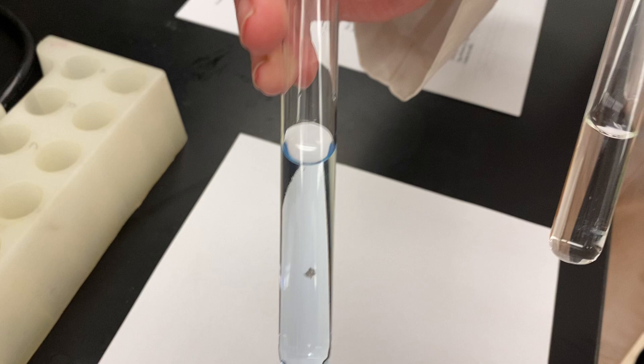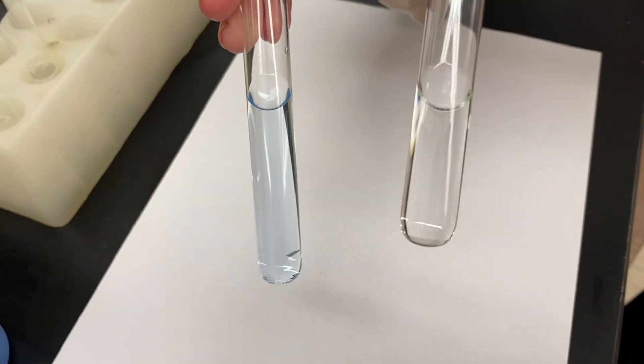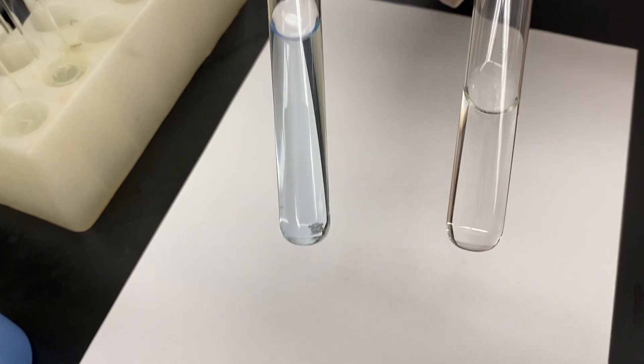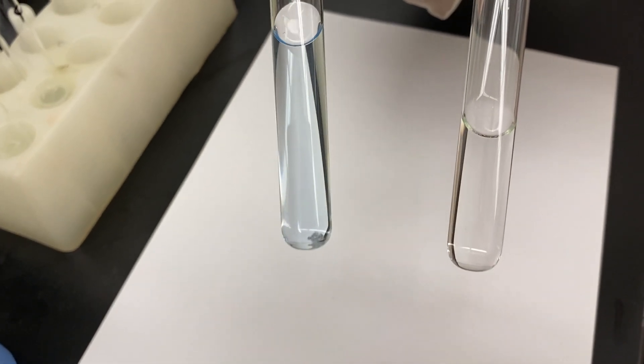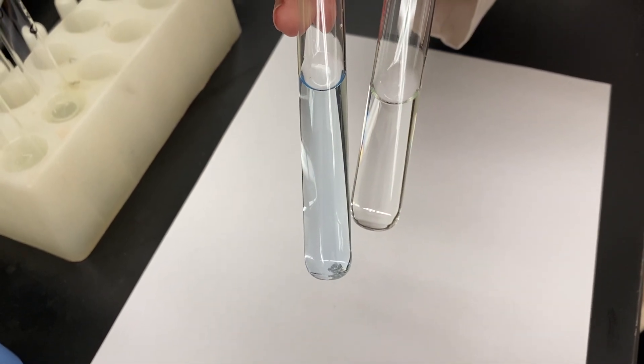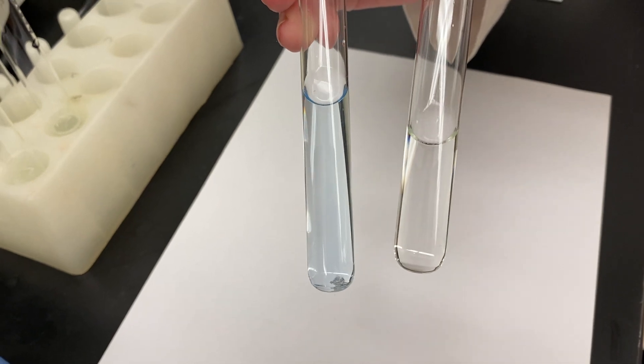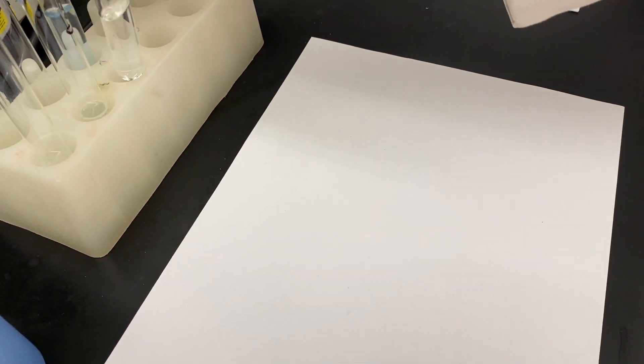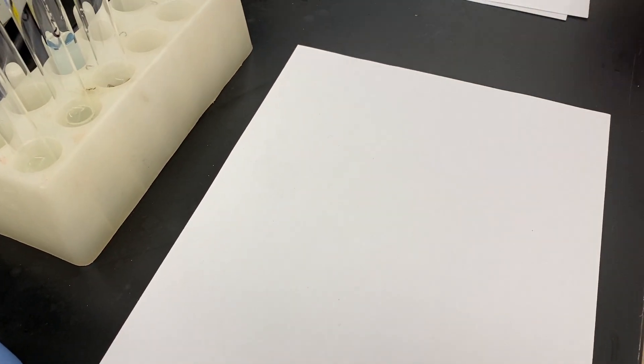On your left is your positive test. On your right is your negative test. You can see that it has turned a really light blue color. You can clearly see it that it's different than the negative test. Negative for peptide bonds. Remember, Biuret reagent looks at peptide bonds which we looked at in part one of this lab.